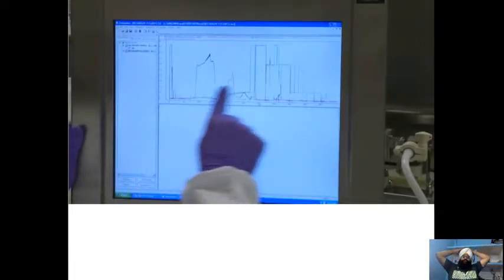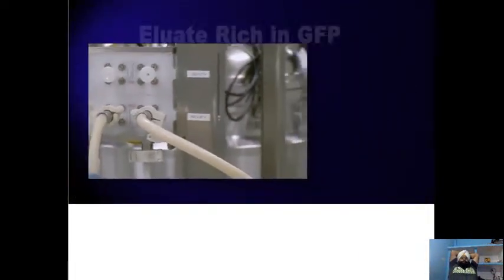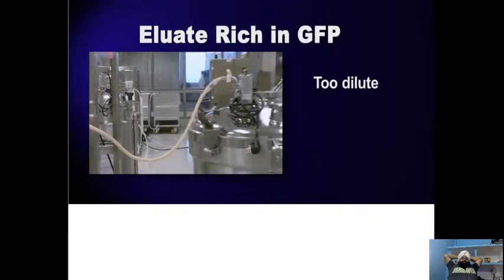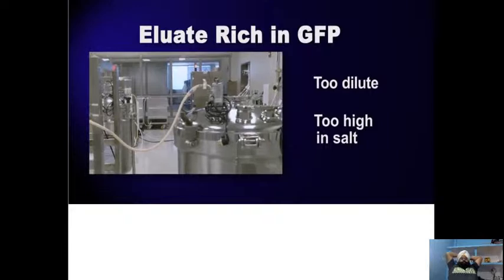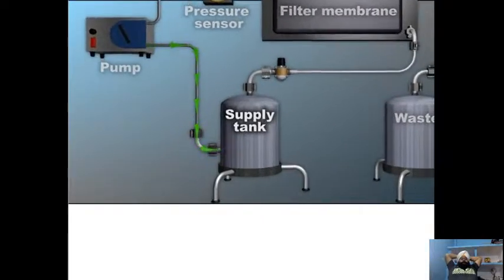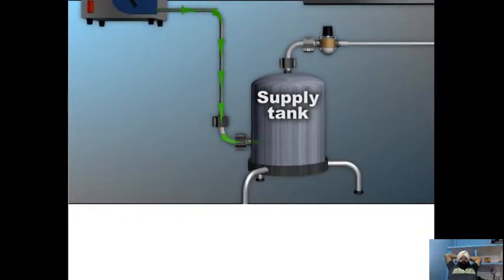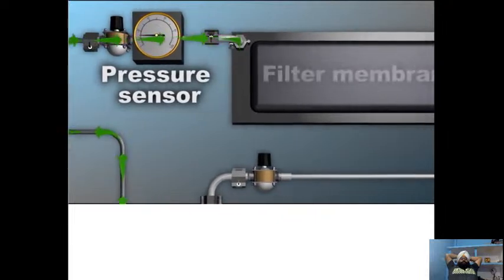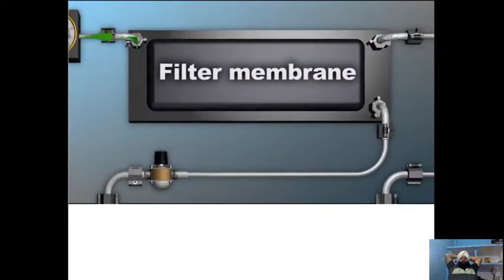At this point in the process, tangential-flow filtration will be used to concentrate and diafilter the GFP product stream. The eluate is rich in green fluorescent protein, but it's still too dilute and too high in salt. As the solution moves through the TFF apparatus, it leaves the supply tank, is pulled through a pump, past a pressure sensor, and then across the filter membrane.